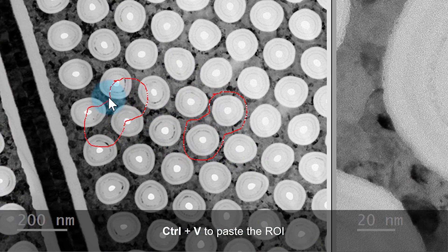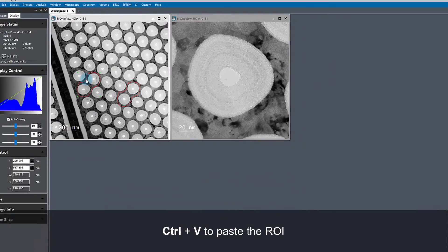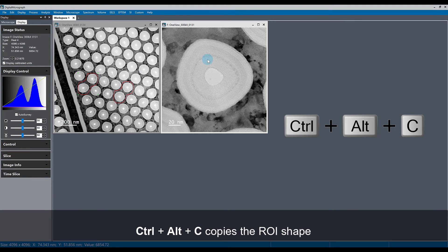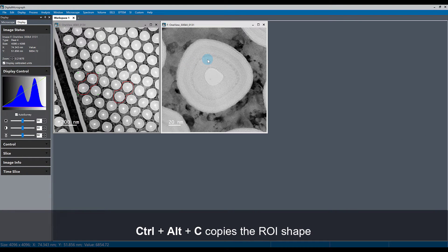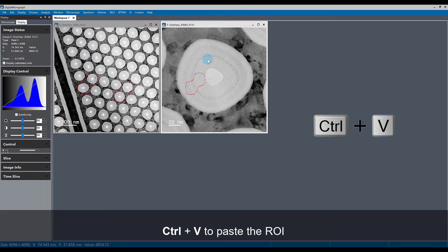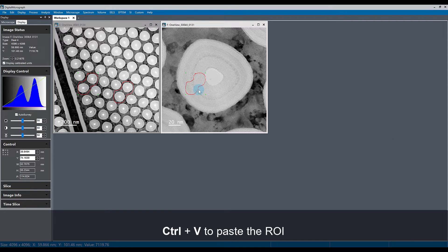Now I have a copy of this ROI that I can move around to a different area. I can again use Ctrl-Alt-C and select a different image and use Ctrl-V to paste that ROI into this different image.